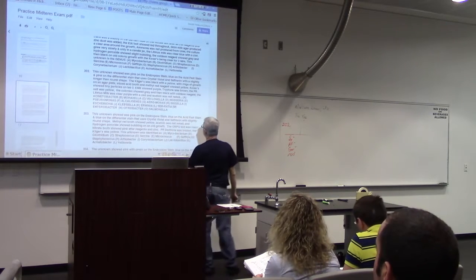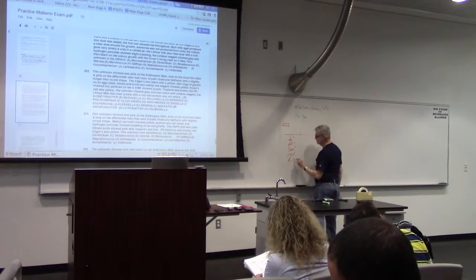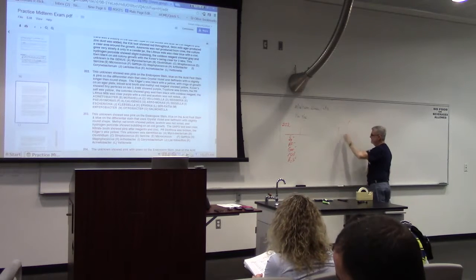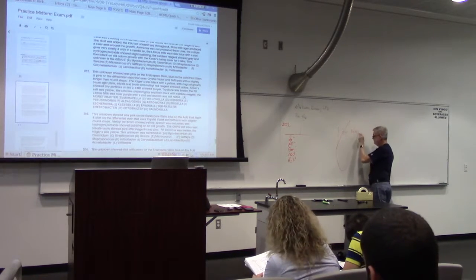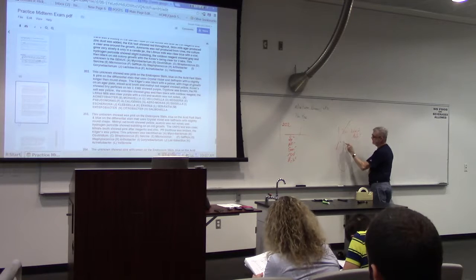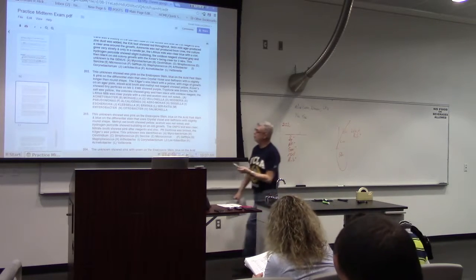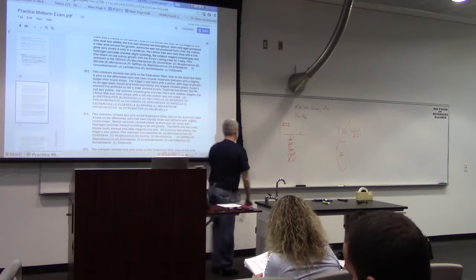Okay, Kligler's was black with a yellow. So you know it's hydrogen sulfide positive. Now, we have to figure out where was the yellow. We have black, which is hydrogen sulfide positive. Some other test is going to tell us lactose or glucose. We know one of them's positive, we just don't know which one yet. Rings of growth in an agar plate, so it's motile.